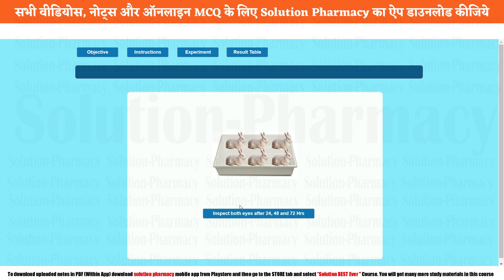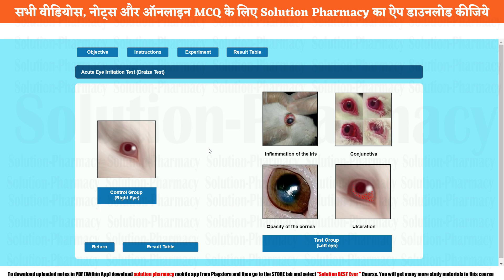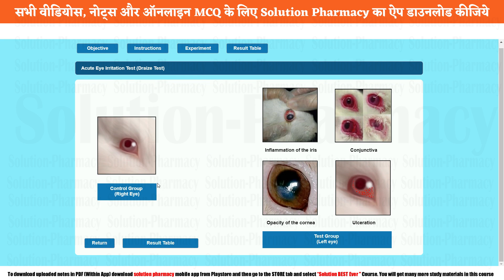Remember, we are applying the test drug on the left eye, and the right eye will be your reference eye to compare both eyes. Now the test drug is being applied on the left eye. We have to inspect both eyes after 24 hours, 48 hours, and 72 hours. On the left side of your screen, you can see the picture of the control group — that is the right eye — on which we did not introduce any drug or medicine. On the right side of your screen, you can find different types of observations — these are possibilities that may occur if the given sample is toxic or irritating to the eyes of the experimental animal.